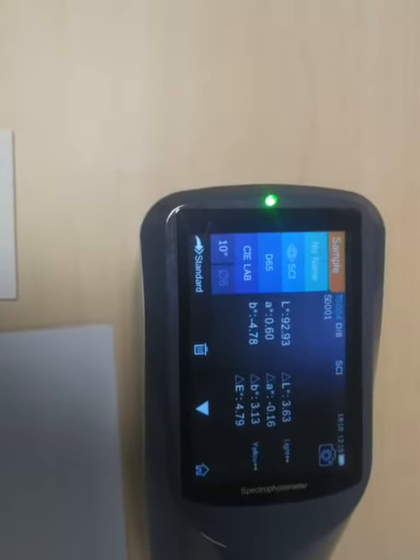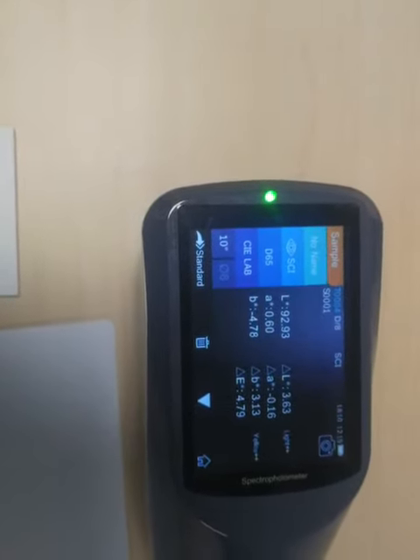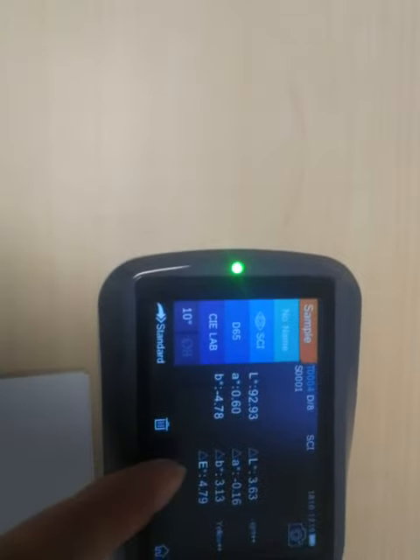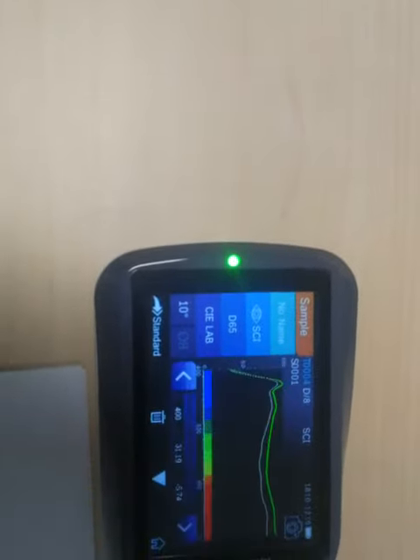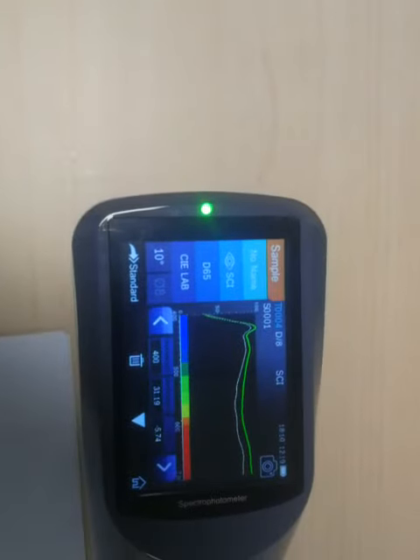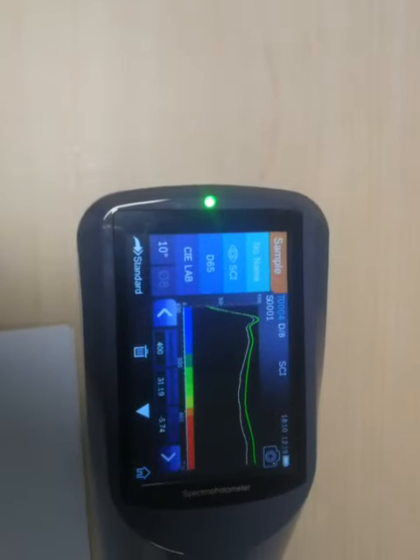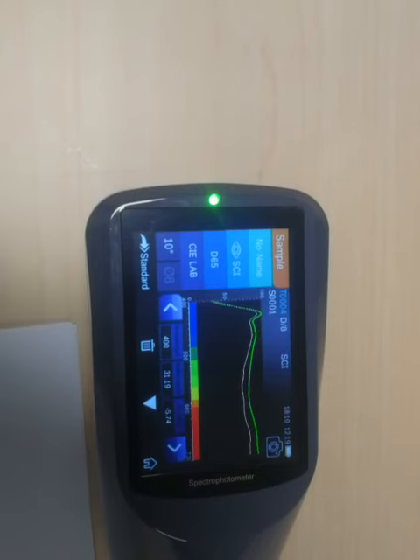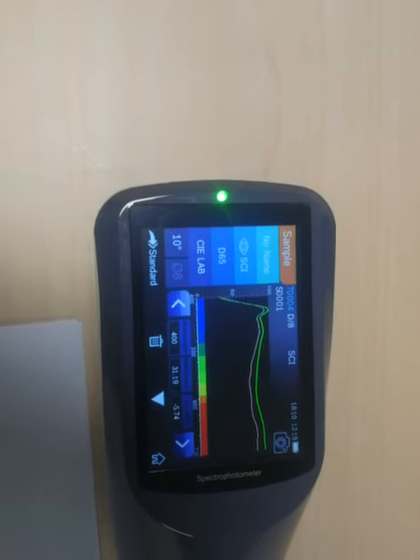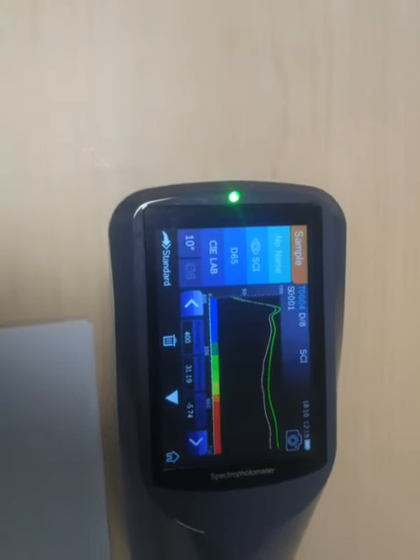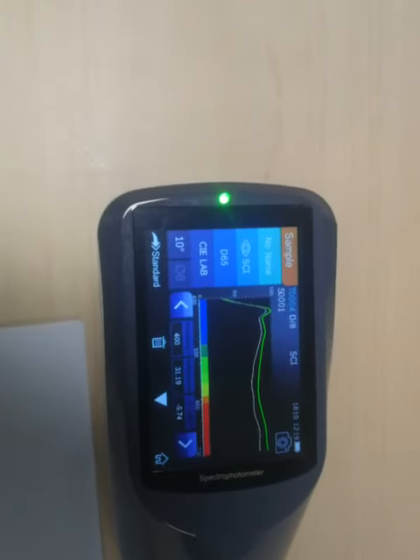And the delta E is the total difference. Then we press here — this is the spectral chart for the sample and the standard. You can see the difference: one is brighter, the other is darker.